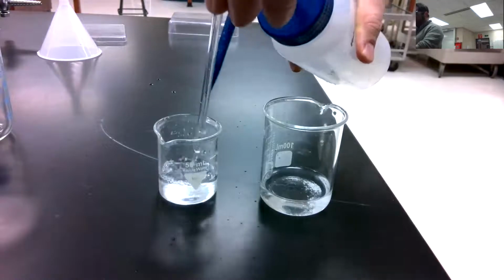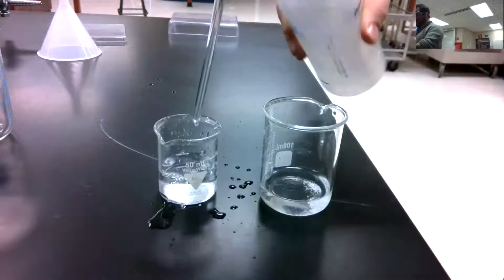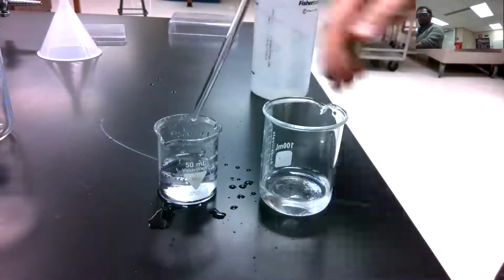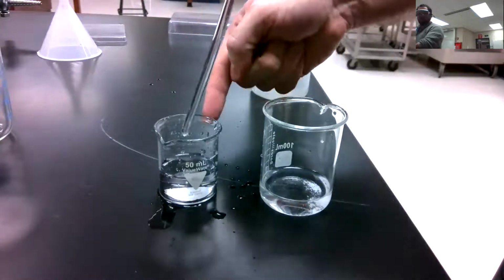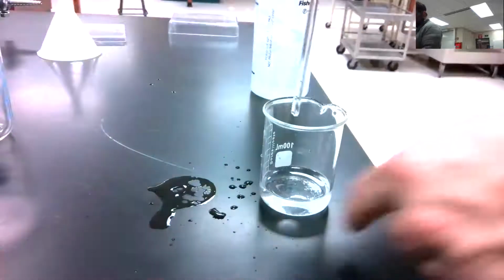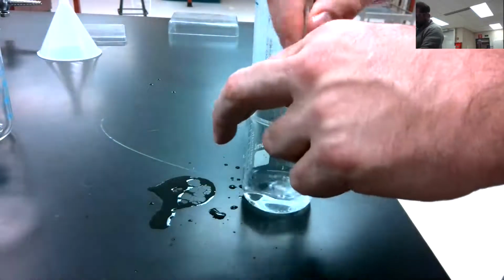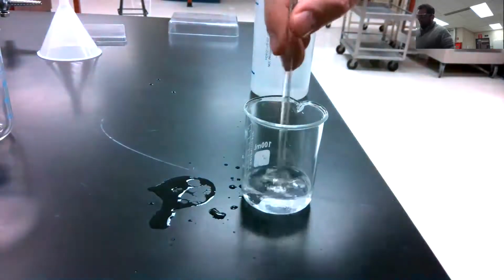A big thing then, I want to make sure I rinse this off. Again, the overall volume of water doesn't matter. I want to make sure I rinse this off so I don't transfer any of the salt particles, they're dissolved in the water, into this one. Okay, this one needs a stir. You can probably tell. You can see there's some salt particles in there. Let's see if we can get them to dissolve by stirring.